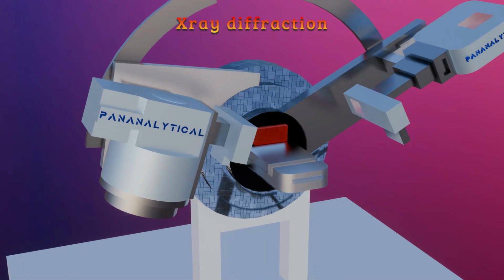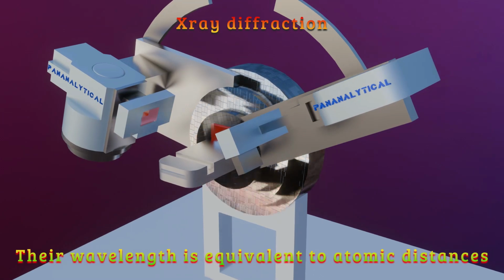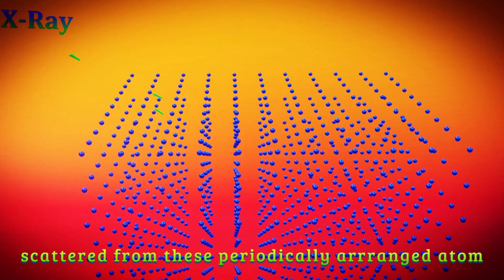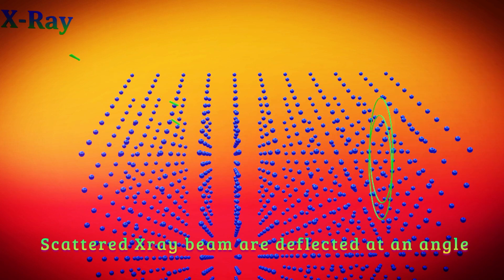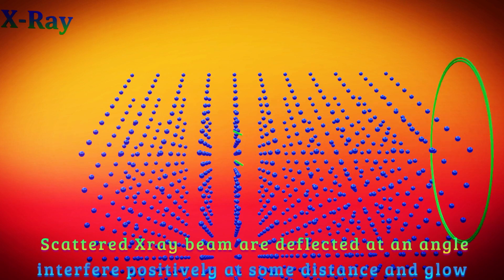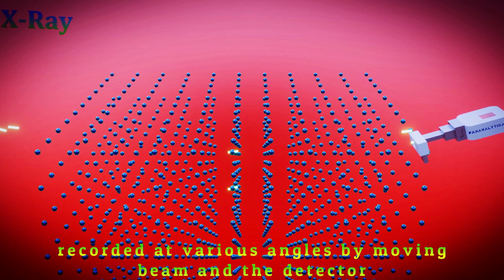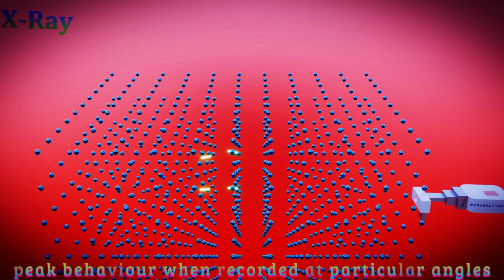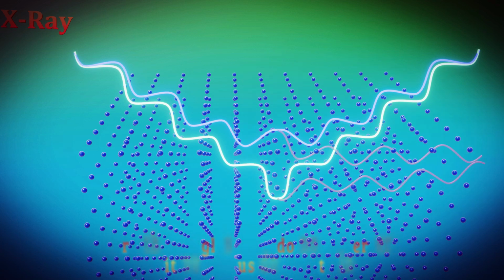Now, the concept of X-ray diffraction comes into the picture. X-ray diffraction is a tool to probe the crystal as the X-ray wavelength is equivalent to the atomic distances. When we shine X-rays on the crystal, they are scattered from these periodically arranged atoms. These scattered X-ray beams are deflected at an angle, interfere positively at some distance, and glow. They are recorded at various angles by moving the beam and the detector. The diffracted X-ray shows peak intensity when recorded at particular angles. For all other angles, they do not interfere positively, thus do not glow.